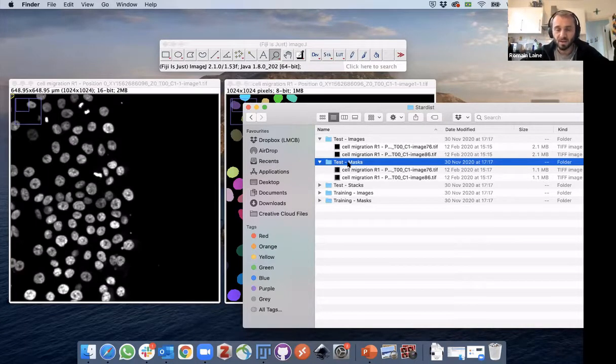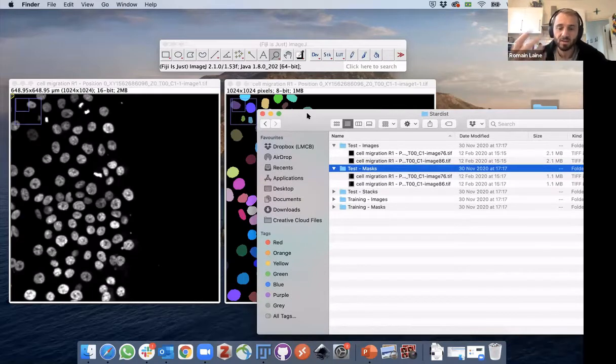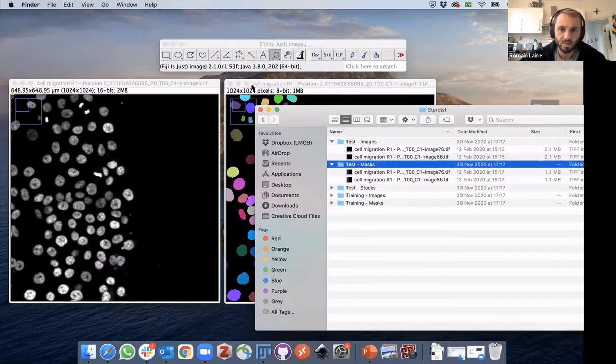You can imagine intuitively that having data for which you have the ground truth and to which you can compare the network outputs can be really powerful to check whether it's done a sensible thing and to convince ourselves that the performance of the network is acceptable. Okay, and again, in our pipeline, we've also integrated a quality control step that can quantitatively and qualitatively help you assess those aspects.